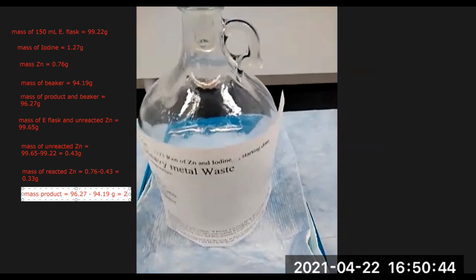And we get 2.08. So we have the mass of reacted zinc. We have the mass of iodine. We can calculate the formula of the zinc iodide product. We have the mass of product. We have the mass of the reactants. We can calculate the percent difference.